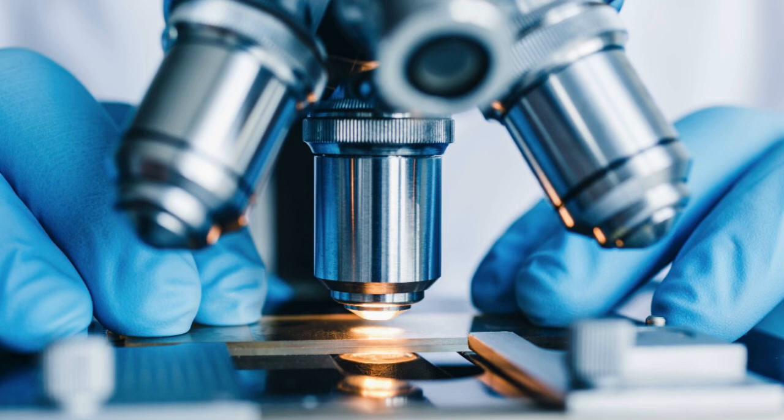There are different types of microscopes. Forensic scientists rely on different microscopes depending on the types of evidence they're examining. No single microscope can handle every forensic task, so crime laboratories are equipped with a variety of specialized instruments.